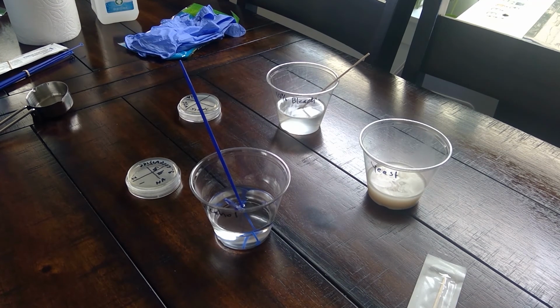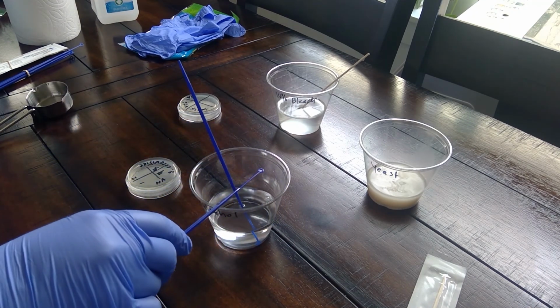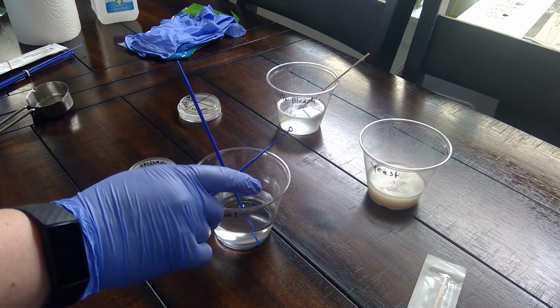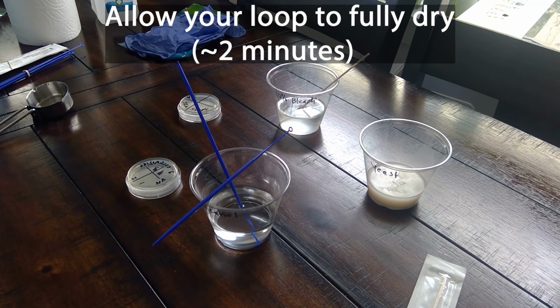So step 20 repeats steps 16 through 19 until all 4 quadrants of S. cerevisiae have been streaked. I'm just going to make sure that it has enough time in the alcohol. So we'll tap it to just let that air dry, and then we'll move some microbes from quadrant 3 into quadrant 4.